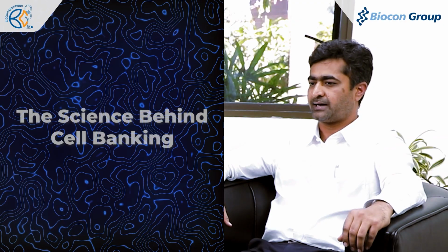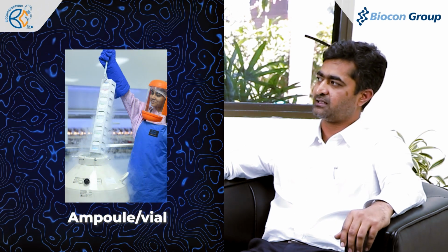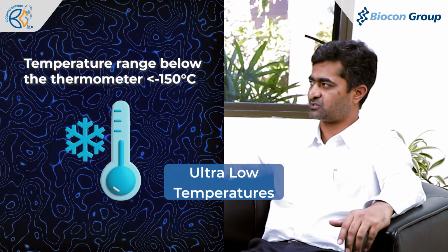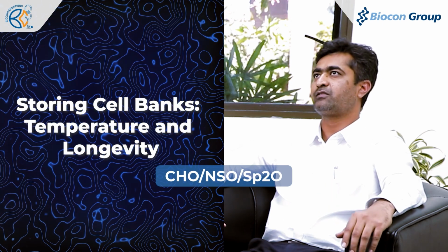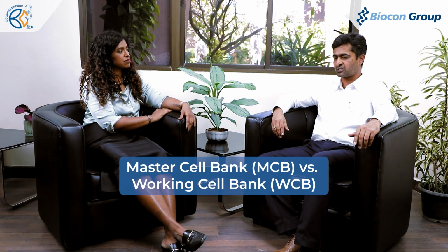So all these containers which have the cells are identical to each other? Correct. So the contents are homogeneous, and they are placed in an ampoule or a vial that is specifically designed to be durable and withstand lower temperatures. So you mean to say the cells stored in a cell bank are essentially kept at ultra low temperatures? Yes, again, depending on the type of cell bank and the cell which we preserve, there are different temperatures. If it is microbial cell systems, we need to go to ultra low temperatures. And for mammalian cells, generally cryogenic temperatures lower than minus 150 degrees Celsius are employed.